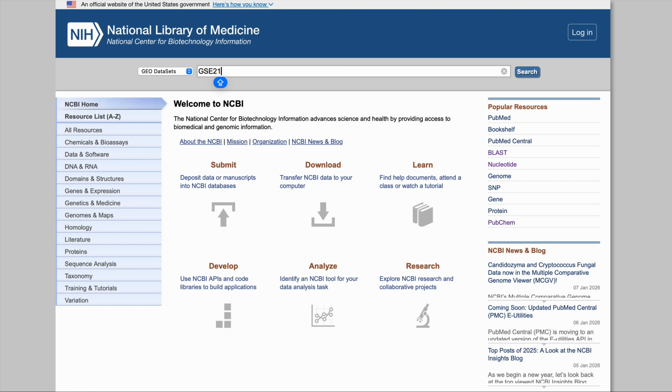It is running in the background. You just have to select the control, test, and so on, and then it will give you the gene expression quantification, as well as the graphical representation of the same, so that you can put it anywhere. All of the p values, everything it will give you. I will show you the same over here.